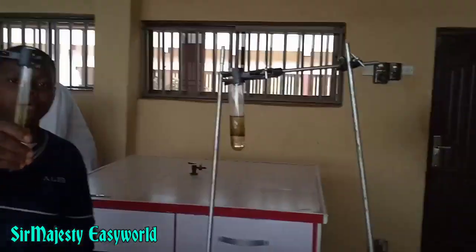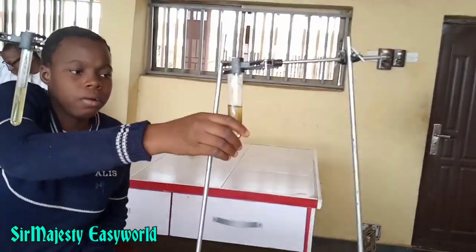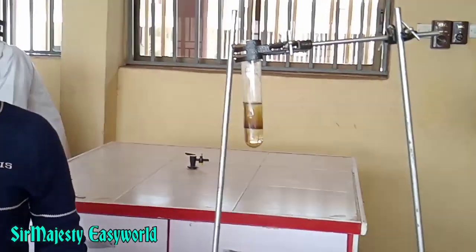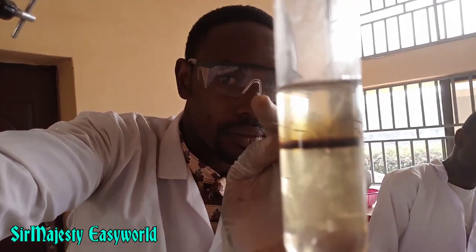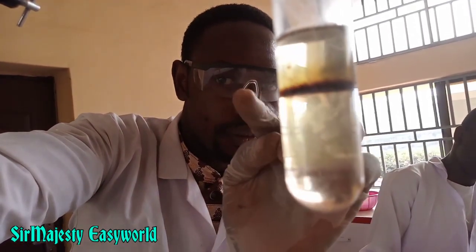The student confirms that this reaction is exothermic. On gently holding the test tube in an upright position, the two layers become clearer and the ring becomes more visible.